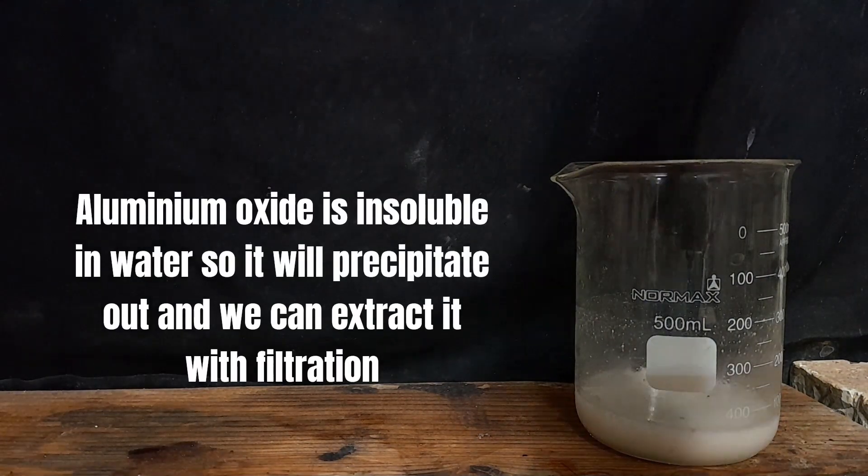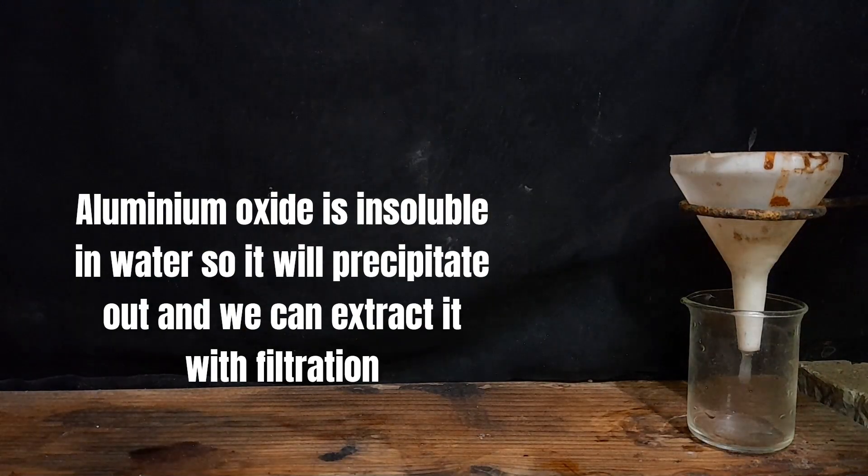Aluminium oxide is insoluble in water so it will precipitate out and we can extract it with filtration.